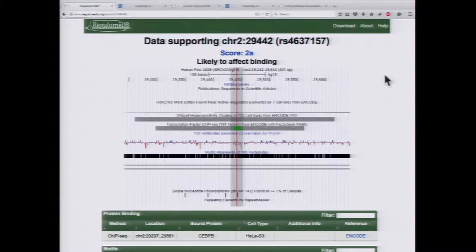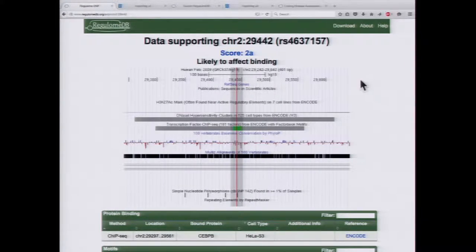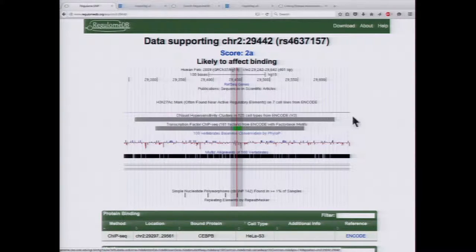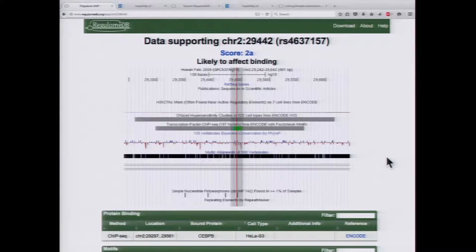When you click on one of the variants to learn more information, this one has a score of 2A, meaning it's likely to affect binding — it has every line of evidence except for being reported as an eQTL in a study. At the very top, there's a small view of the UCSC genome browser with ENCODE-related tracks: a track for DNase I hypersensitivity clusters, transcription factor binding annotated with motifs from factorbook.org, and conservation as well.